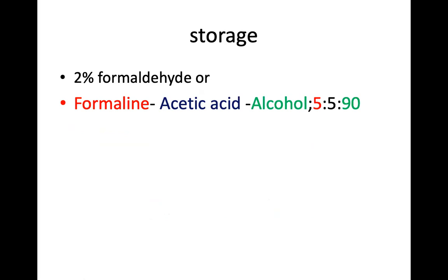Certain plants which are either succulents or otherwise unsuitable for pressing and drying techniques are preserved in a suitable liquid preservative such as formaldehyde 2 to 5%, or formalin aceto alcohol. Conifer cones and palm fronds are stored dried in labeled boxes.